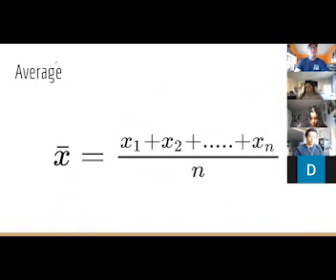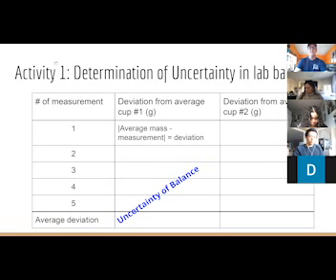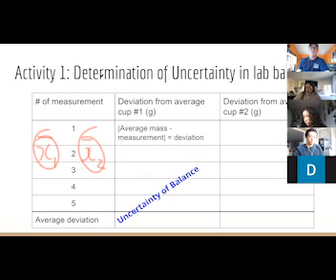Yeah, make a note of the unit. Yes, yes. So now we're going to figure out the uncertainty, because what we're going to do, we're going to measure or calculate the deviation from each one. Now we're going to have our average. So we'll have our average mass of cup 1, and that'd be our average mass of cup 2. So each separate measurement, we're going to subtract from the average and get our deviation.